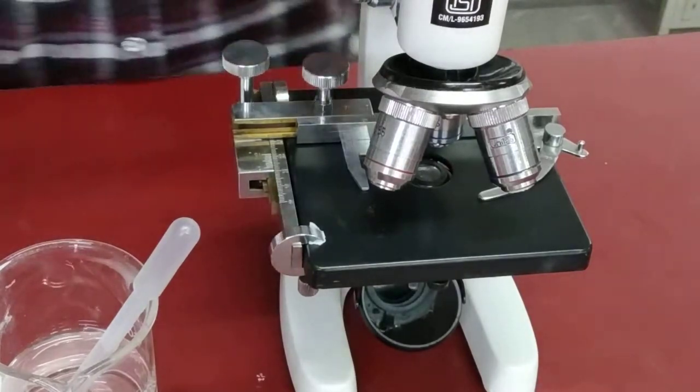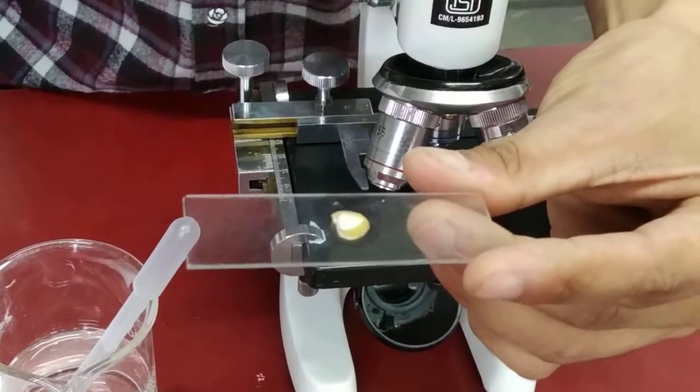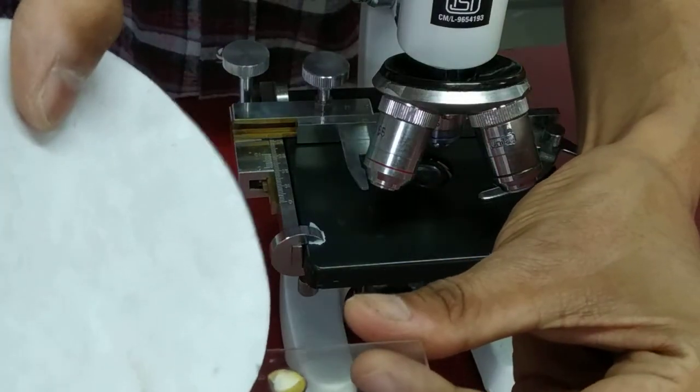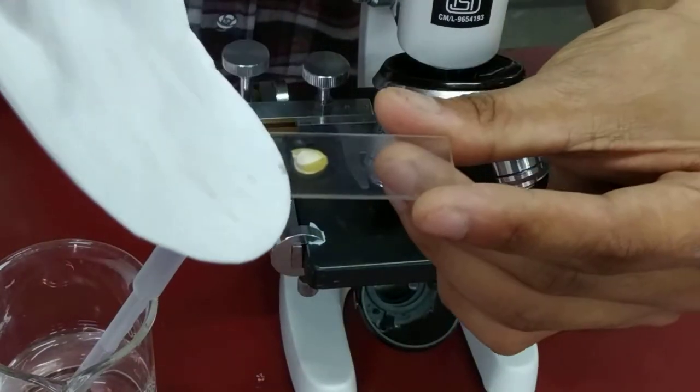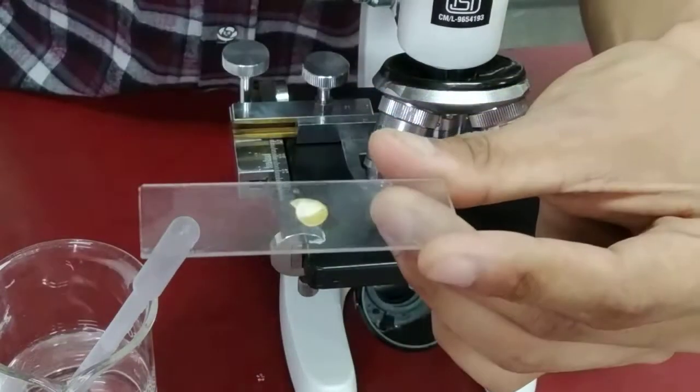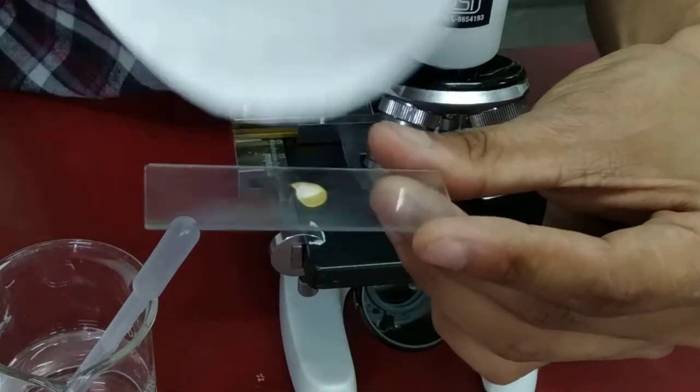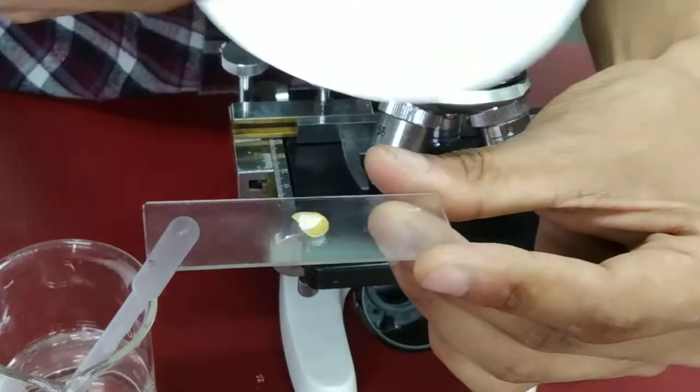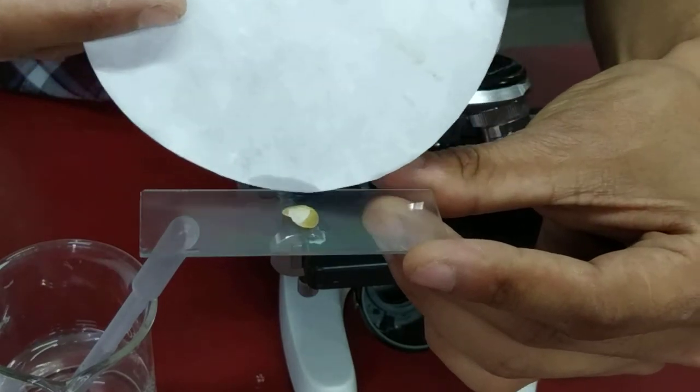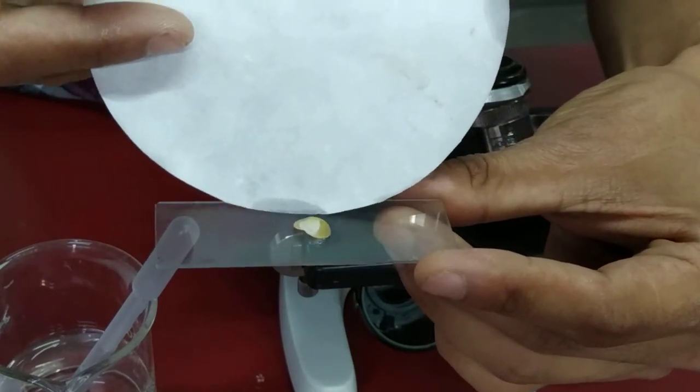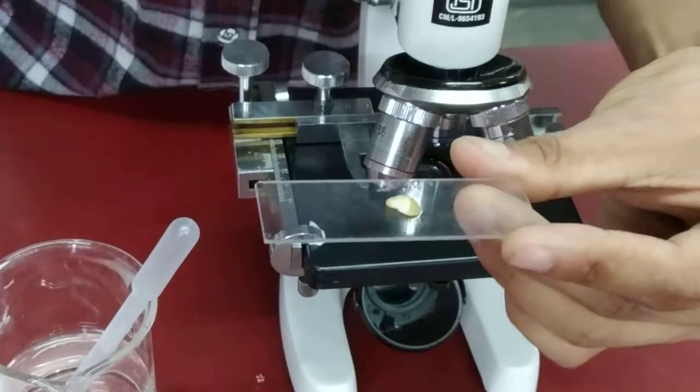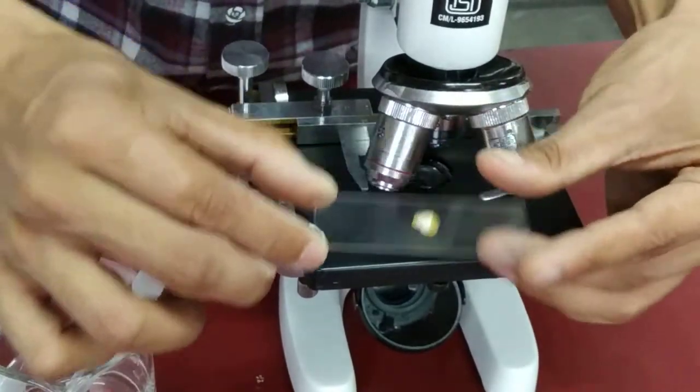So after the transfer of the section on a slide, what you are going to do is slowly dry off the water with the help of a filter paper. Then place it under a microscope.